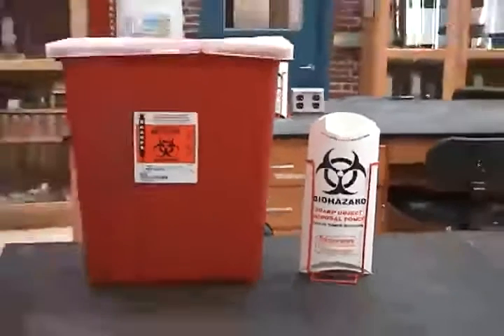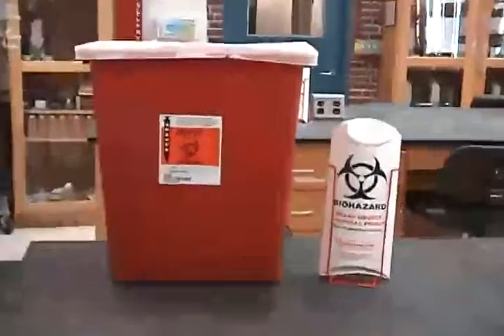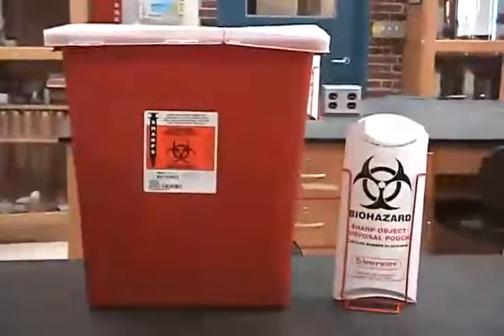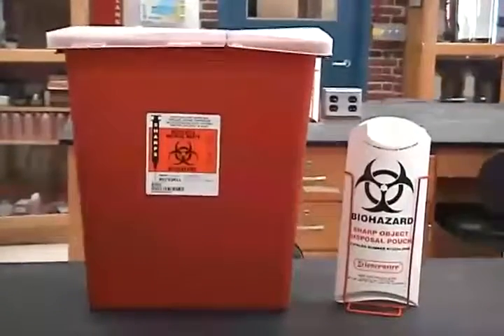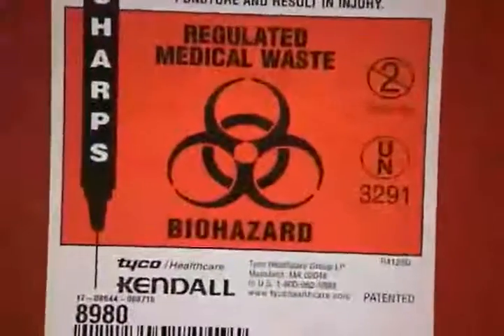Sharps trash. Sharps are disposed of in the sharps trash receptacles only. Sharps include pipettes, microbiological loops, and any other sharp object that may poke a hole in a trash bag liner.